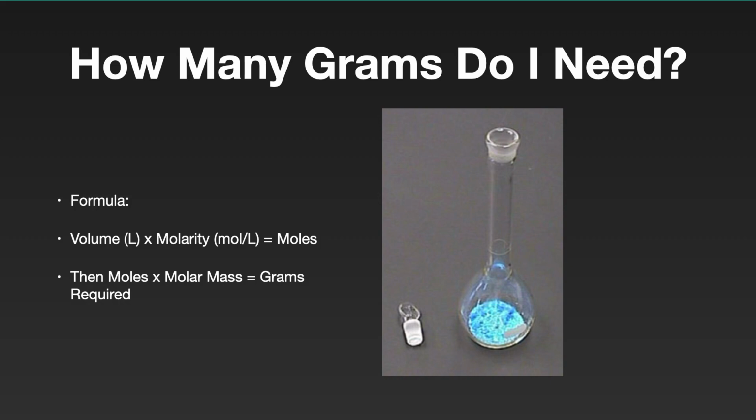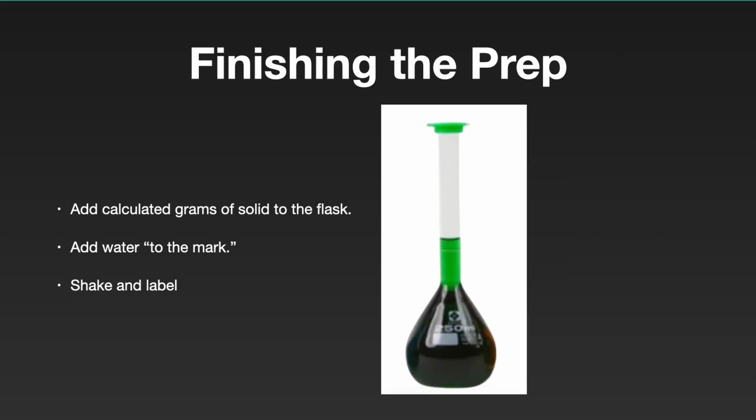solid. Once you have your mass, you place those 4.15 grams into your flask, fill it with water up to that single etching on the neck, and give it a good shake to make sure the solution is perfectly homogeneous. This is exactly how I prepare the chemicals for our lab experiments.